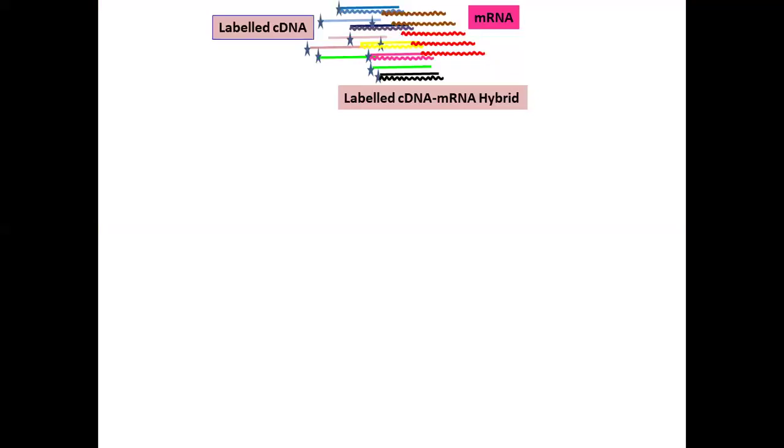As I told you, this mixture has labeled single-strand cDNA, mRNA and cDNA hybrid, as well as mRNA. Now you pass this mixture through the hydroxyapatite column.